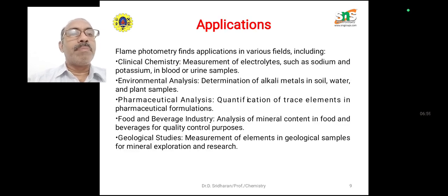Applications of this technique, flame photometry: clinical chemistry, environmental analysis, pharmaceutical analysis, the food and beverage industry, and geological studies.